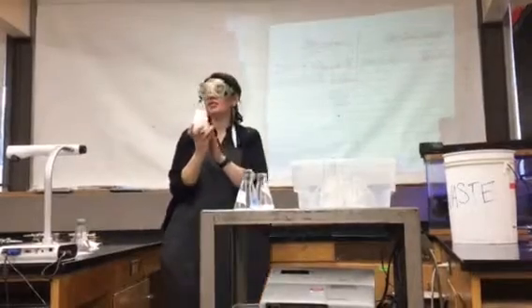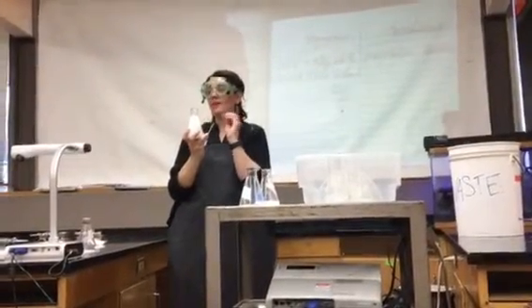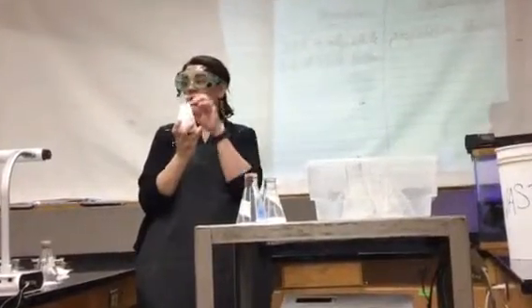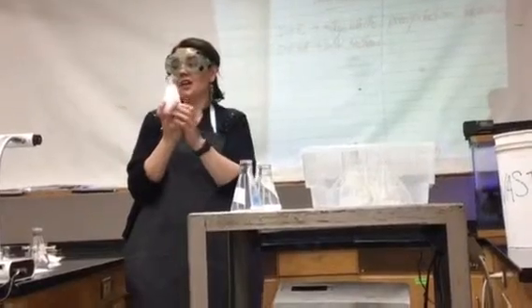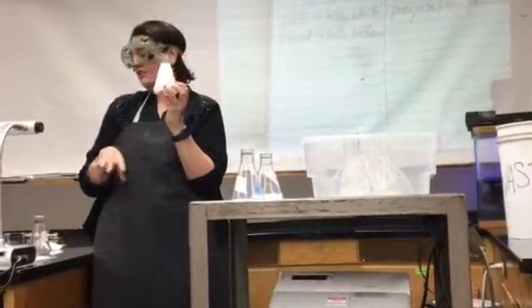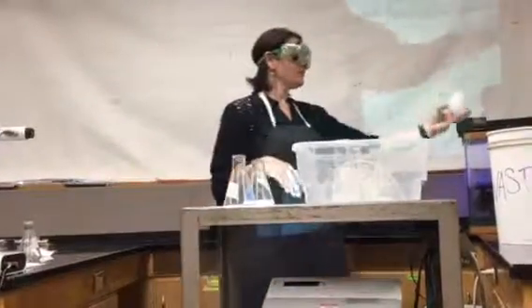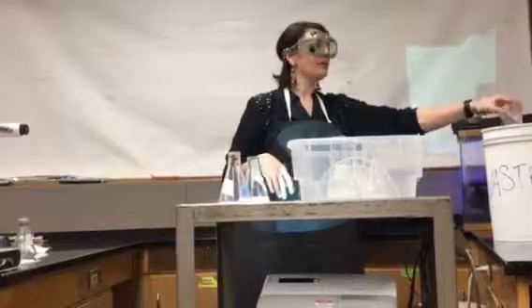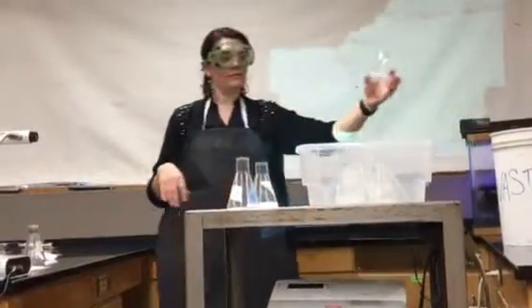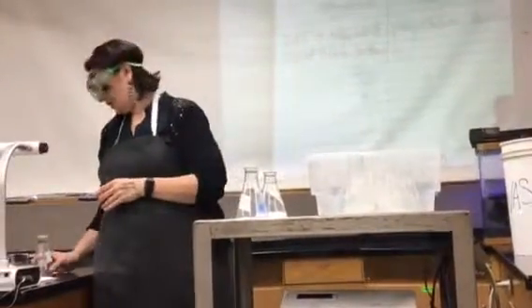So here's the thing you should know. Acid makes the precipitation go away. It makes it dissolve back in the water. And base makes it show up. A is acid, and that's why it made the precipitation go away. And it's also why it made the color go away. And then C, what do you call them? Is C base? I'm gonna let you figure that out right now.